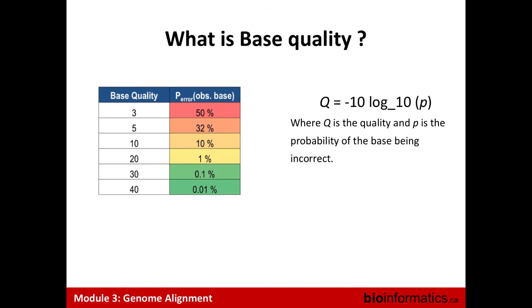What does a Phred score mean? It means this value represents -10 log base 10 of a probability. All the qualities you will see, mapping quality, base quality, variant quality, will be a Phred score. The only difference between these values is which probability is represented in my formula.